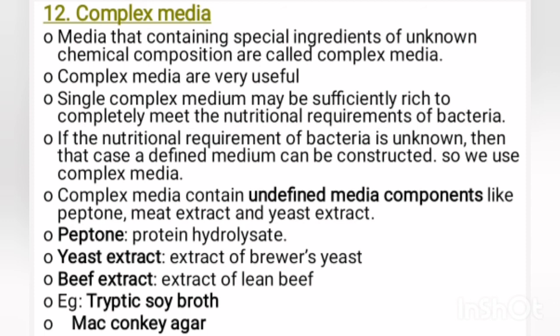Complex media contain undefined components like peptone, meat extract, beef extract, etc. Peptone is the protein hydrolysate prepared by proteolytic digestion of meat, casein, soya meal, gelatin, and other protein sources. It serves as a source of carbon, nitrogen, and energy.